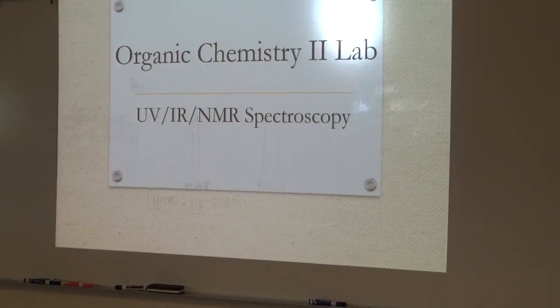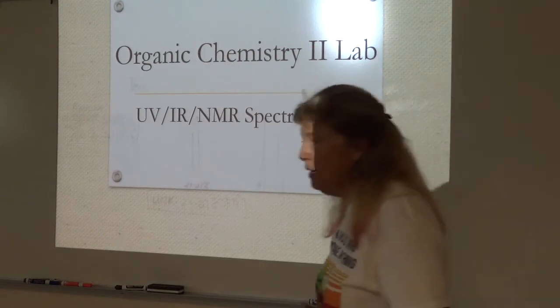Welcome. Today in Organic Chemistry 2 lab, our one and only technique lab. All the other labs in the semester, we will be producing products. Today, we're going to use a technique called spectroscopy, and indeed three different types: UV, IR, and NMR.